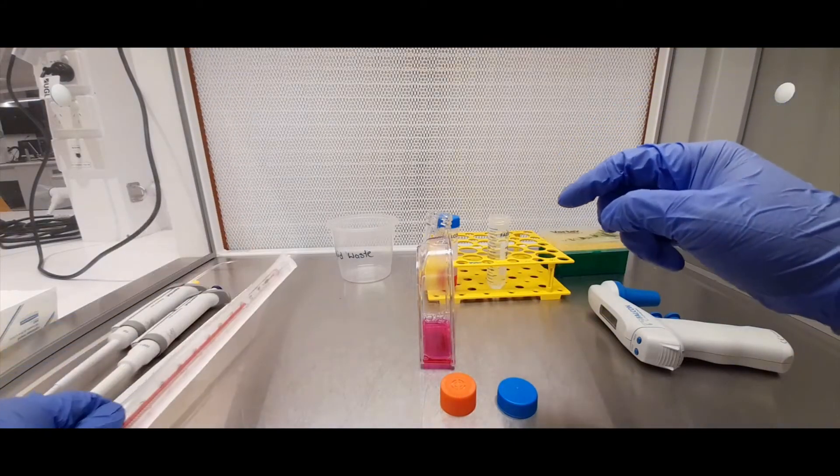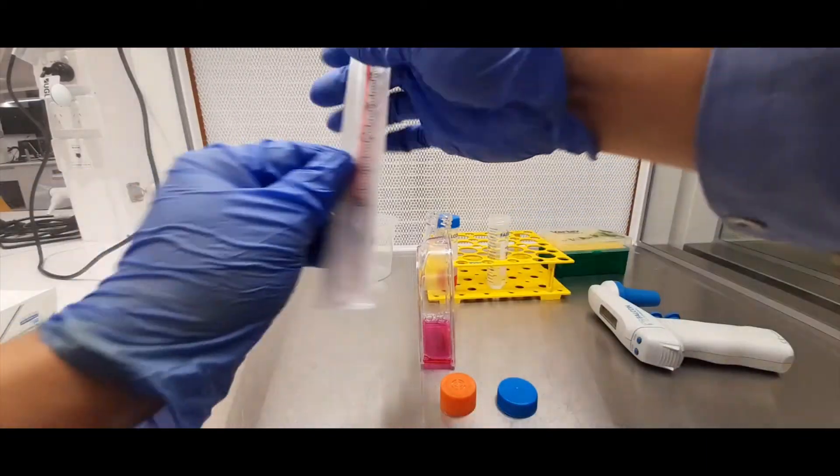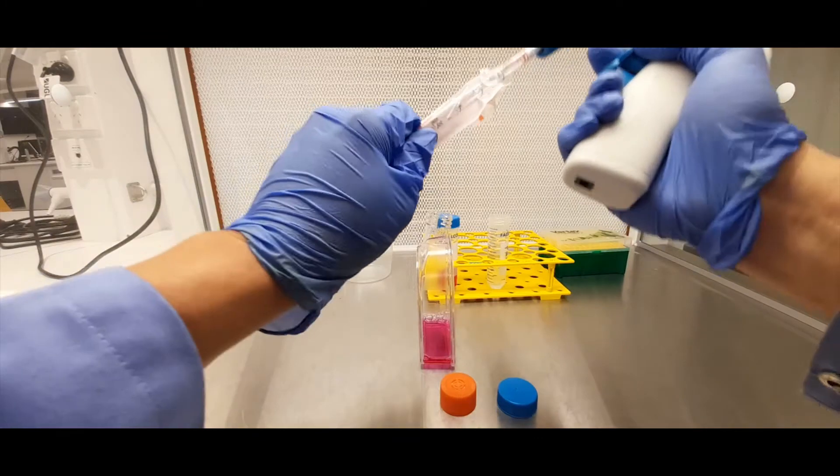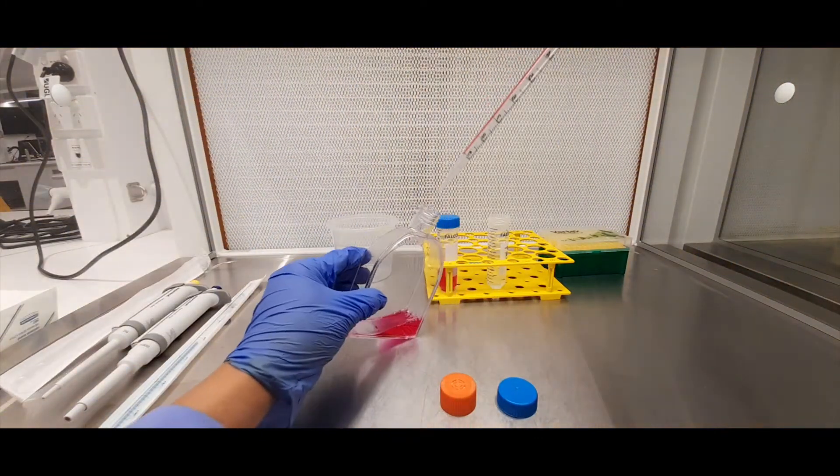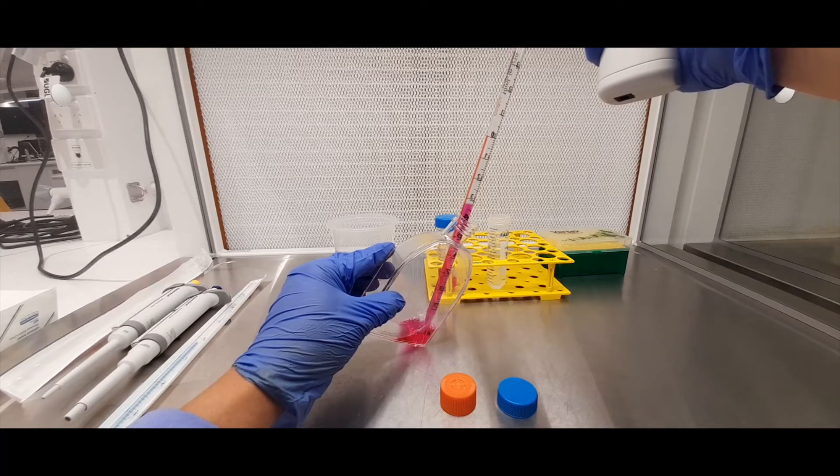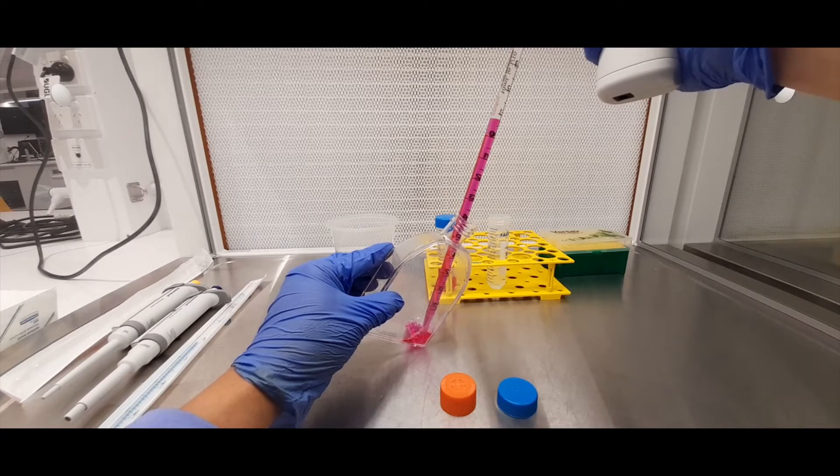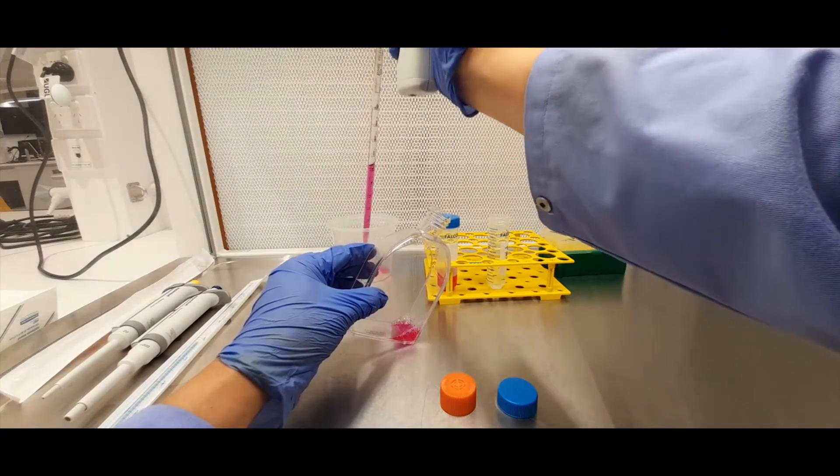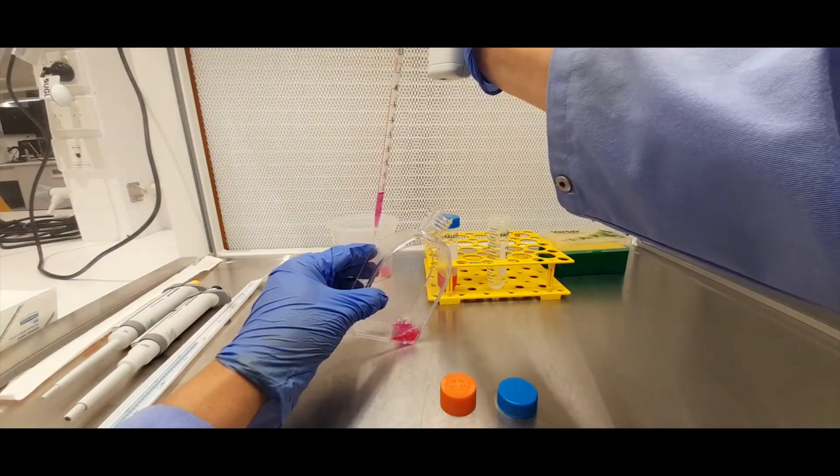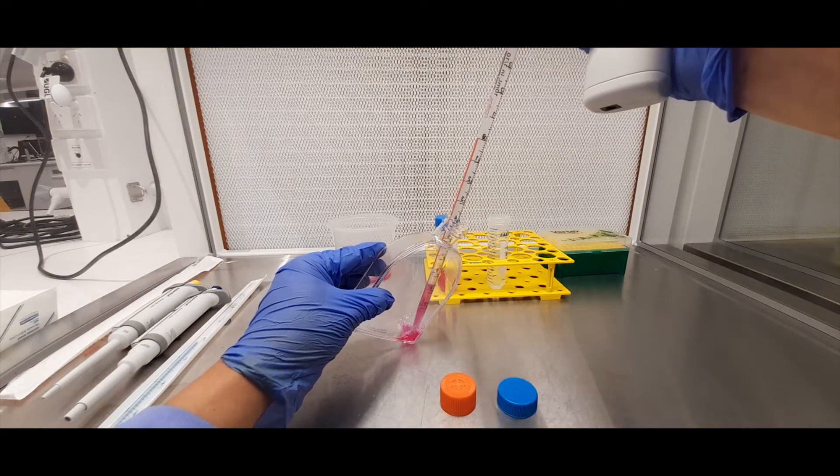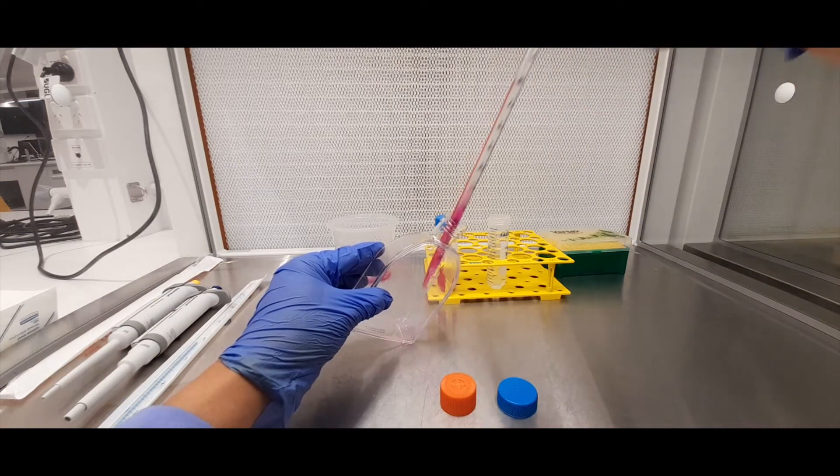So to remove the media from that flask, you get one of these serological pipettes and your pipette aid. You angle the flask so you can then draw up that liquid. And then you can put it into a liquid waste container. And you can do that a couple of times like that till you get rid of all the liquid.